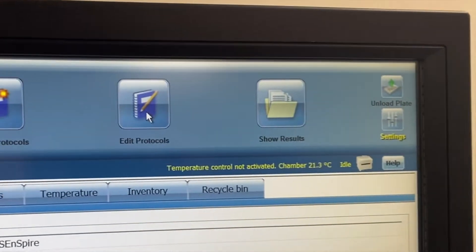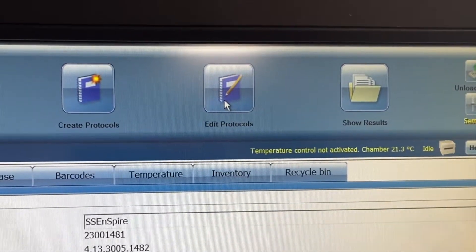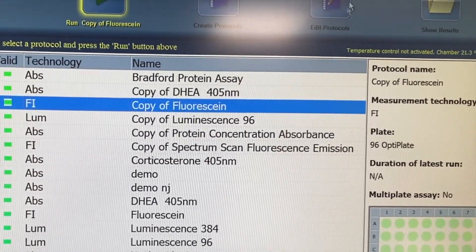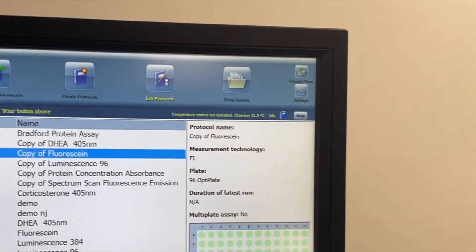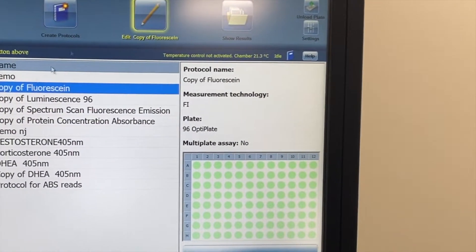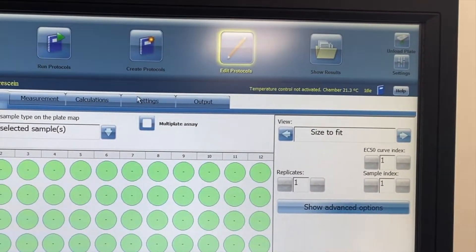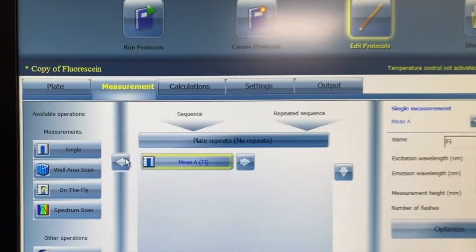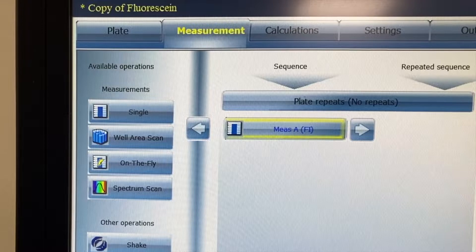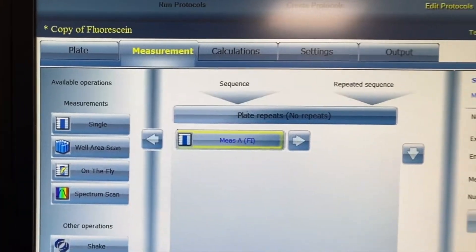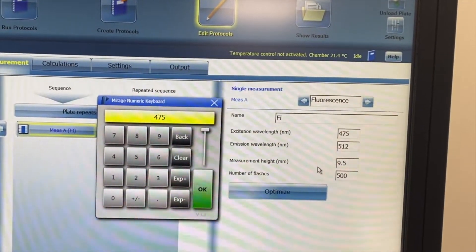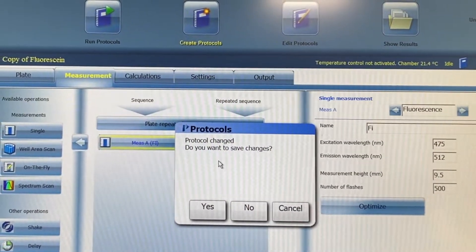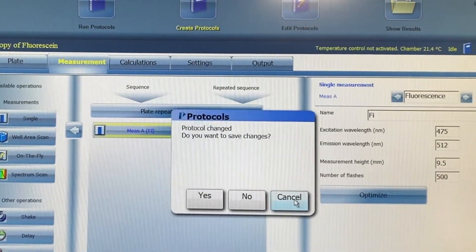Say you didn't want to create a new protocol but there was an existing protocol you just wanted to edit — you can do that too. In the protocols list, say I want to edit a fluorescent protocol. Rather than making a copy, just press Edit, then press Edit again to change specific things. From the settings heading you can change the name; in measurements you can specify the scan type, add shakes, delays, or temperature requirements, and change the excitation and emission because this is now a fluorescence read. Clicking onto any other protocol will ask you to save, and you can save it then.